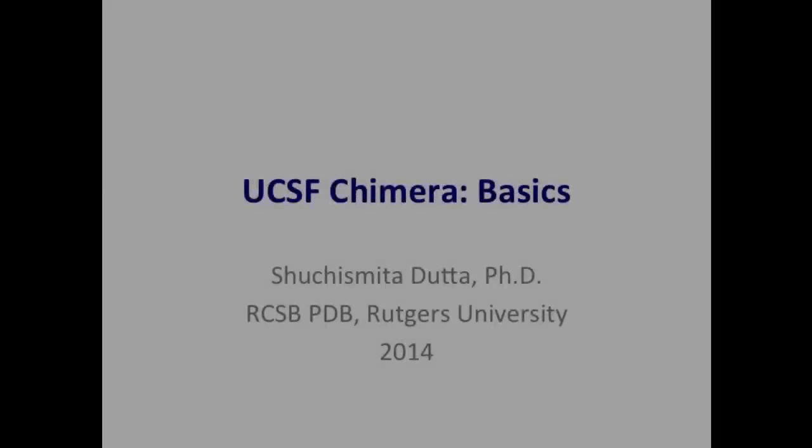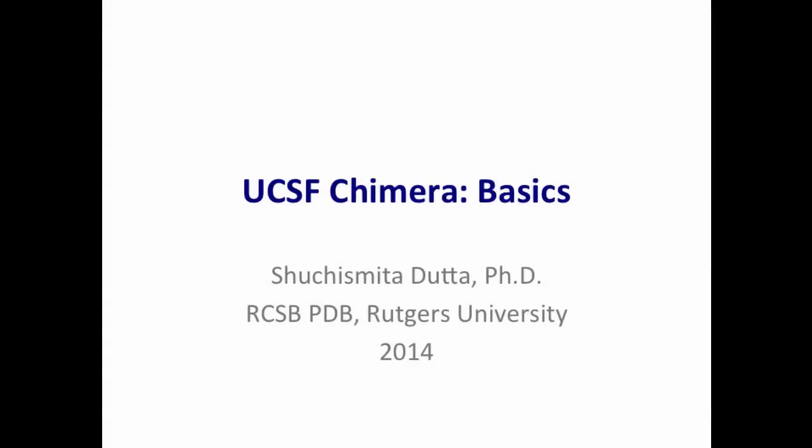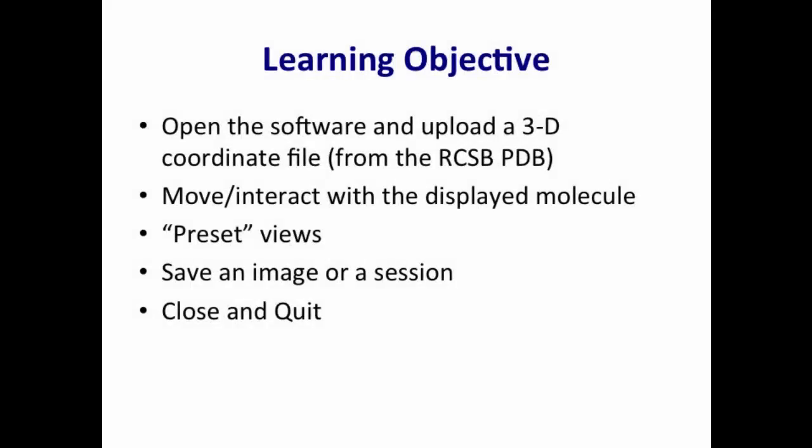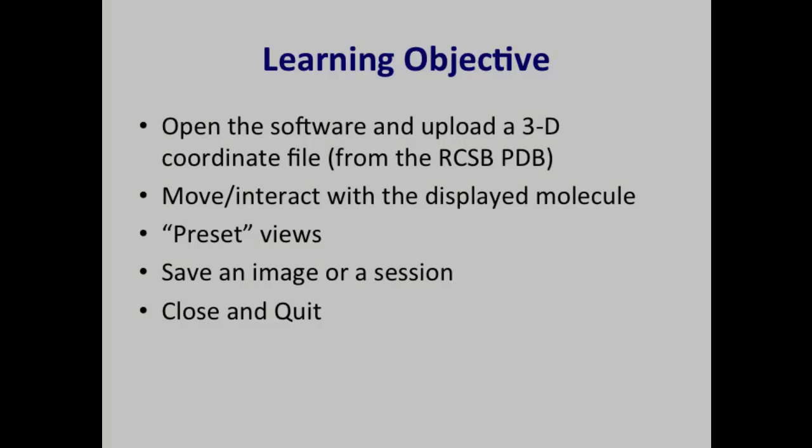Hello and welcome to the UCSF Chimera basics tutorial. In this tutorial you will learn to open the software and upload 3D coordinates from a PDB file, move or interact with the displayed molecule, check out some preset views, save an image or a session, and finally close and quit the software.